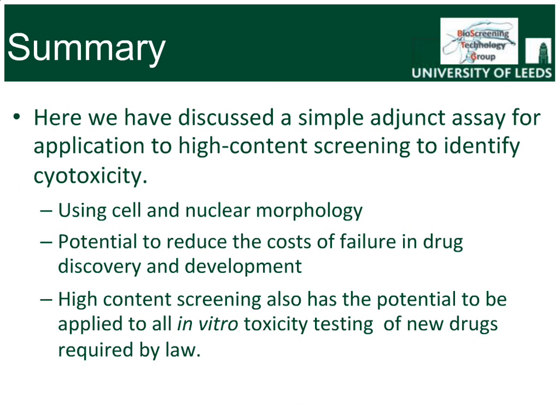With further work, it may be possible to assign distinctive morphological changes to mechanisms of action. This has been discussed in the studies by O'Brien and Pearson that were looking at hepatotoxins by high-content screening. Indeed, this is another area where high-content screening is coming to the fore to streamline in vitro toxicity testing. Our work adds another string to the bow for the use of high-content imaging to detect cytotoxicity and reduce downstream compound failure.